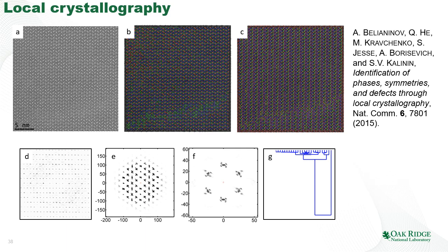Now, the next question becomes whether we can apply this type of analytics to different types of images. For example, images which are almost perfect, at least by manual examination. So this is an example of an image of the same material, but a different part and different orientation. Here you can clearly see the almost ideal ordering pattern, and you really cannot see much here.